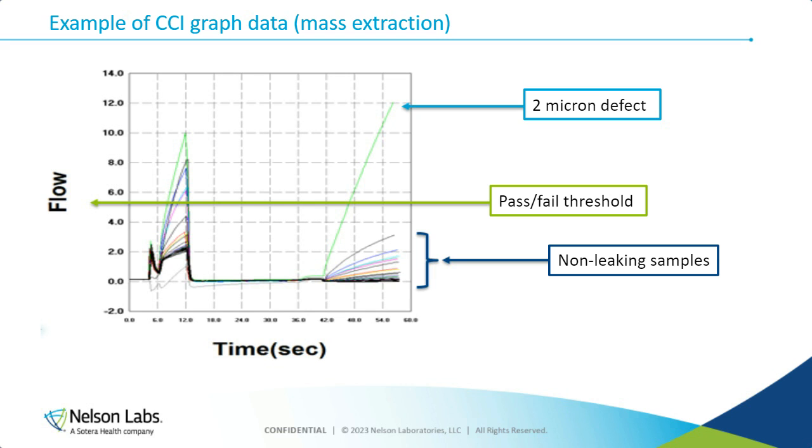And then next, I have two peaks, a little one and then a big one. That is my large leak check. That's the second leak check that it's going to run. And for this particular method, if it goes above 15, then it's going to cut off the test right there. Again, those are both sample prep steps that are going to go through that larger, less sensitive detector to protect that super sensitive detector, to make sure that it doesn't get saturated. Then you can see I have a long, flat area. This is my stabilization phase.